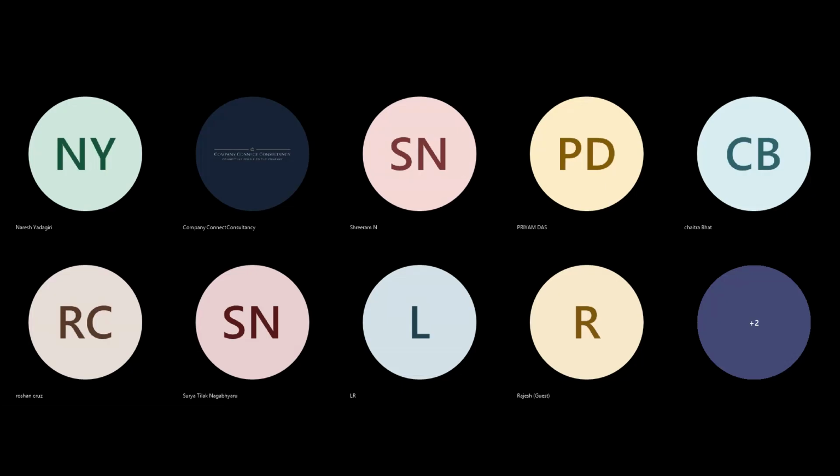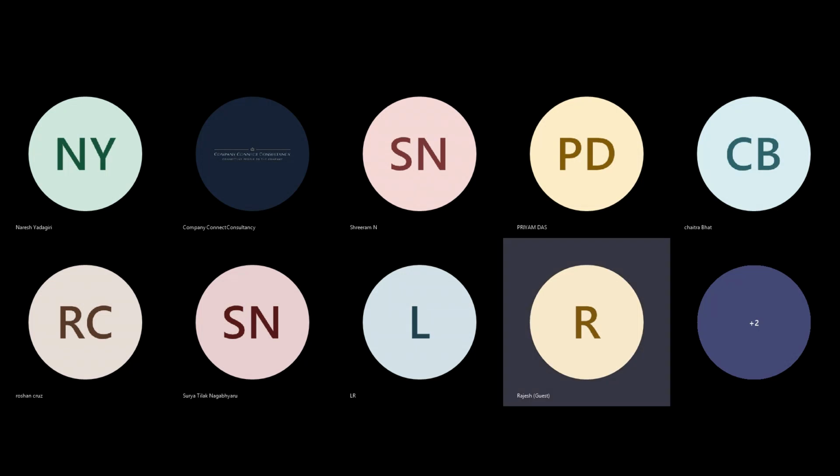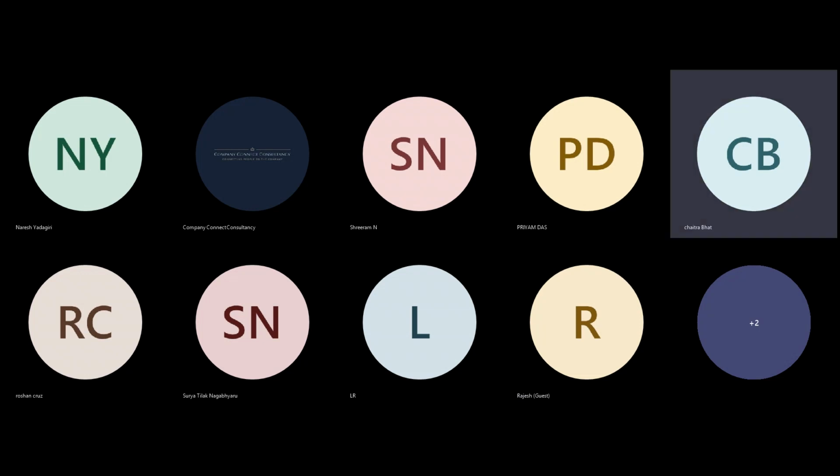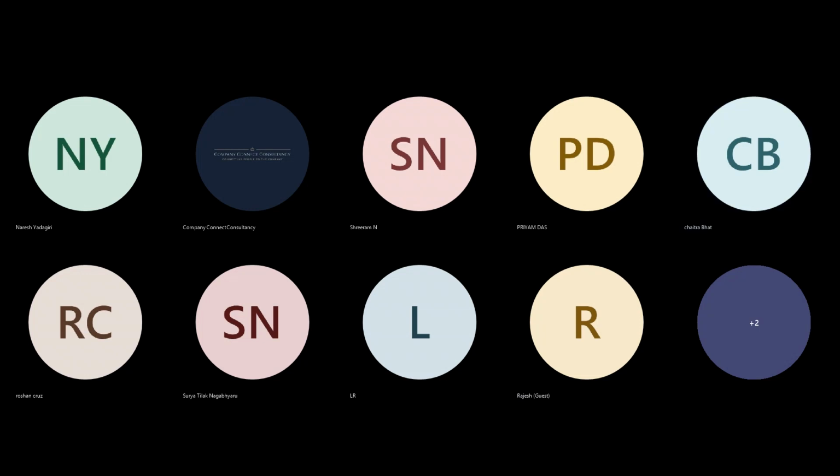Sample Manager, LabVantage, Caliber LIMS. Anyone else? Anyone can speak up if you are working on any other kind of LIMS.